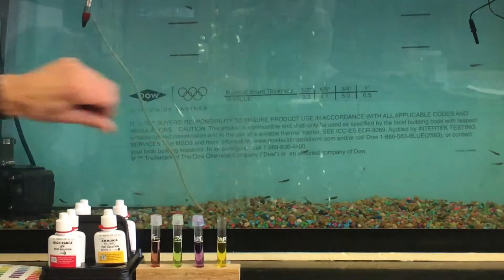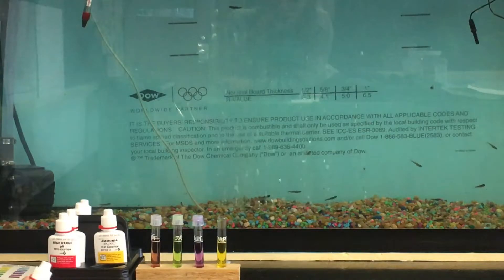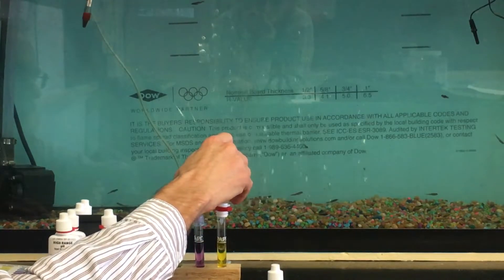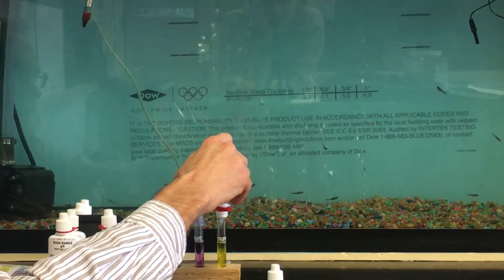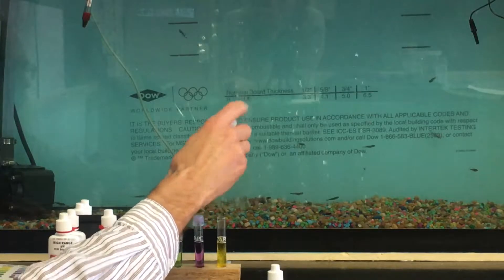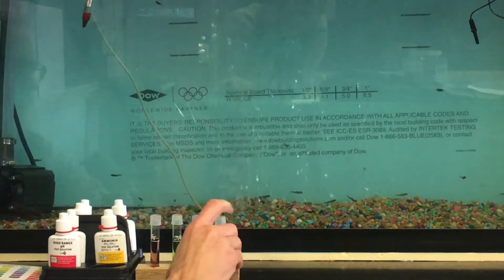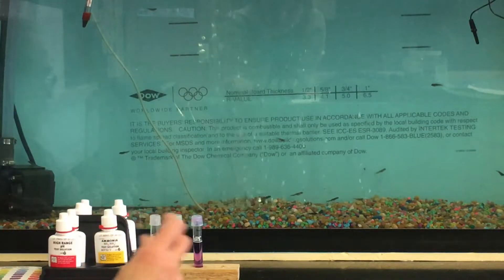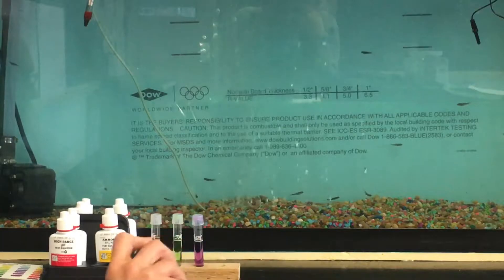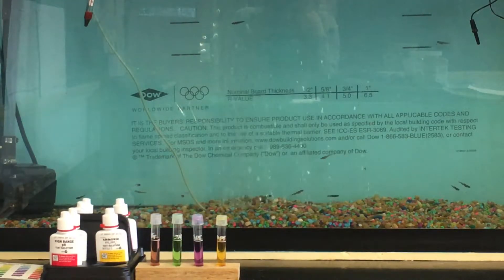Be careful not to get this solution on your fingers — it's not extremely dangerous, but wash and dry your hands well after running the test. Then add test solution number two, ten drops straight up and down right into the test tube: one, two, three, four, five, six, seven, eight, nine, ten. Tap the cap on and agitate that one vigorously for one full minute — you have to time that.